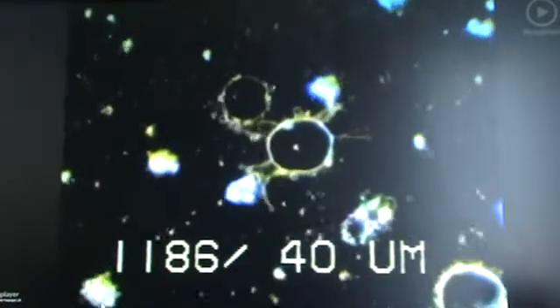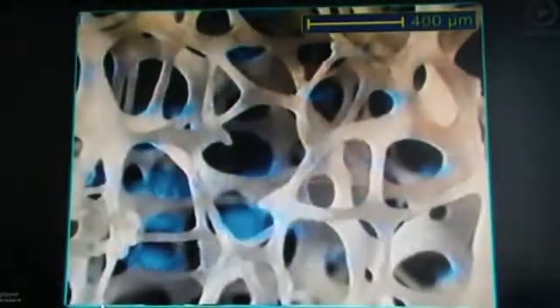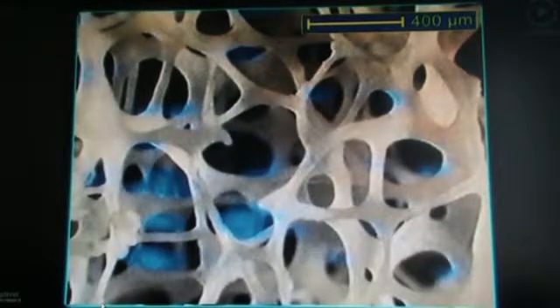These comparisons illustrate some of its many commercial advantages, especially in the disciplines of medicine, biology, pharmacology, chemistry, polymers, electronics, metallurgy, as well as interdisciplinary research.